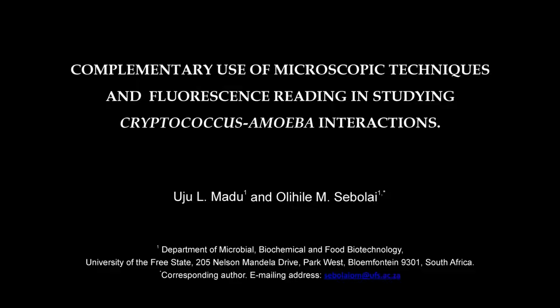The overall purpose of this procedure is to use microscopy as a tool to study the phagocytosis of the pathogenic fungal species Cryptococcus neoformans by its environmental predator, amoeba.